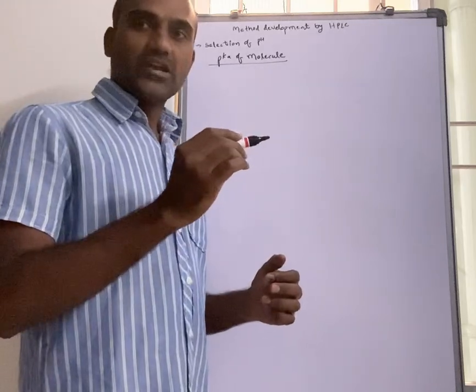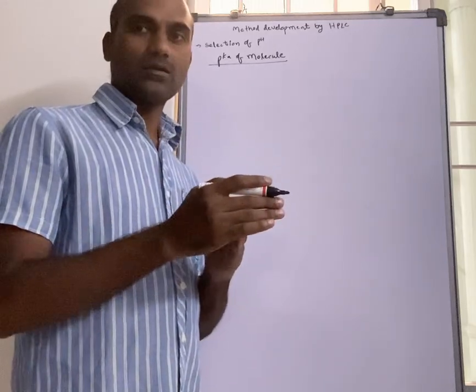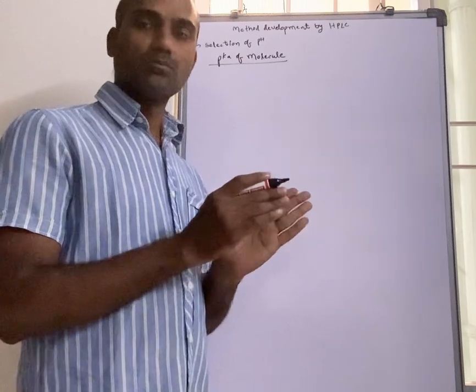A sudden change in retention time and response will occur with a sudden change in pH. That will give you the pKa of that molecule.